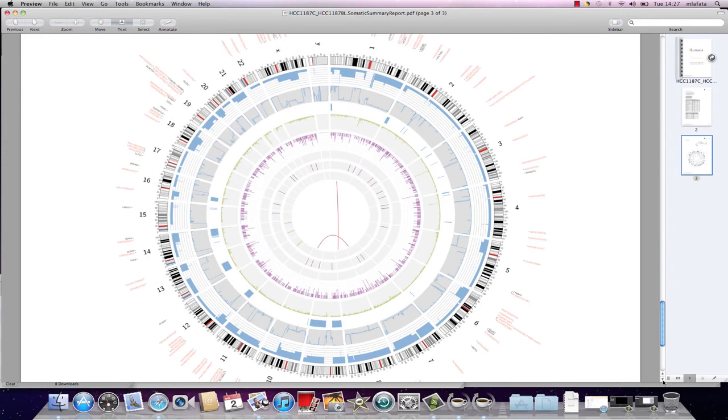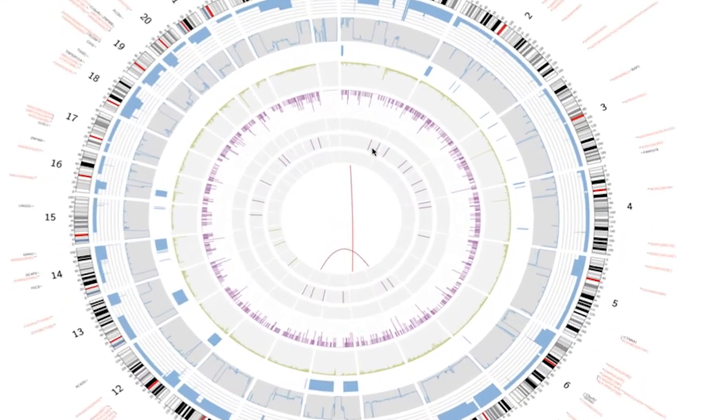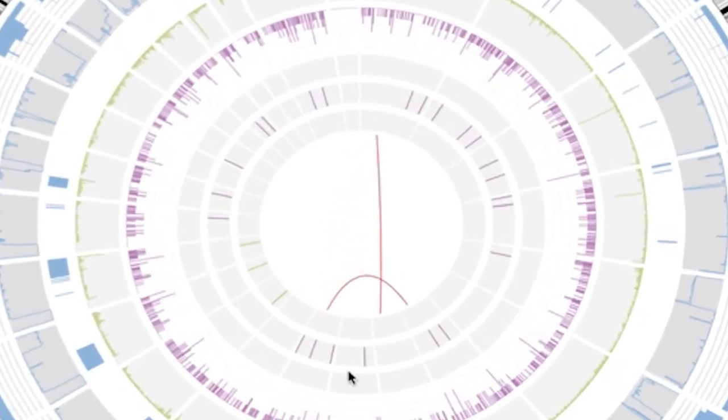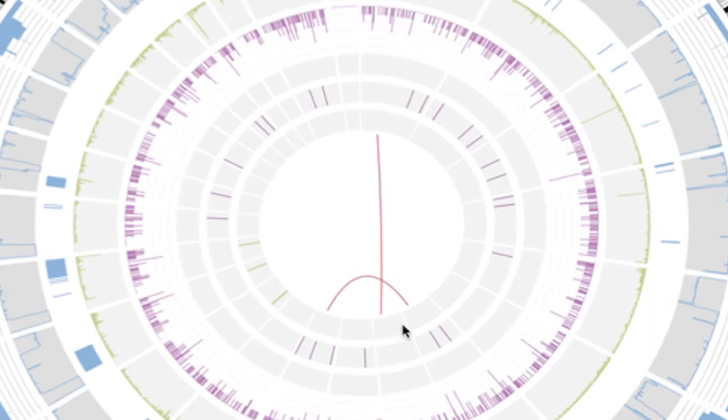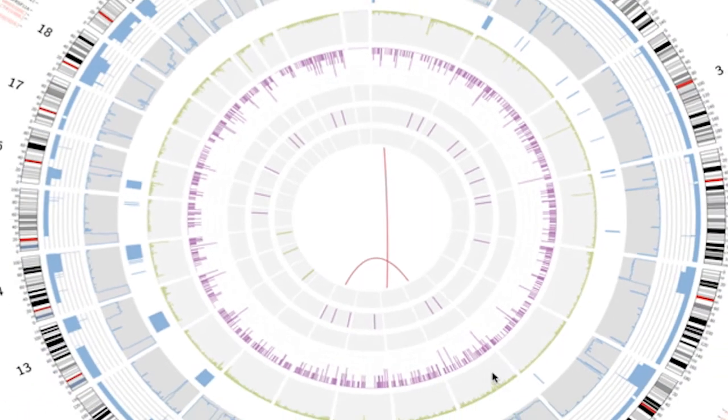If we look at the CIRCOS plot from this data, we see translocations between chromosomes 1 and 8 and 7 and 10, three regions of segmental duplication, and a large number of insertions.